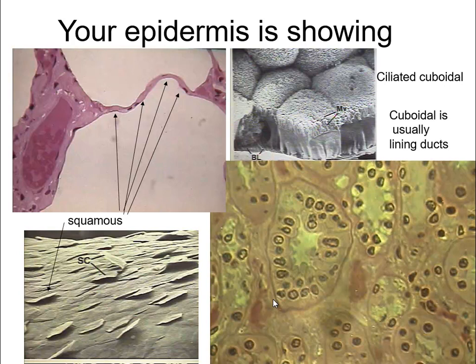Over on the top right are ciliated cuboidal cells. Cuboidal just means cube-shaped or square. You're going to find cuboidal cells lining ducts that are secreting something. They generally occur in a ring, and you can see the lumen — the hole — in the middle of the ring. So cuboidals are pretty easy to detect: they're in a ring, they have a hole in the middle, and they're square.